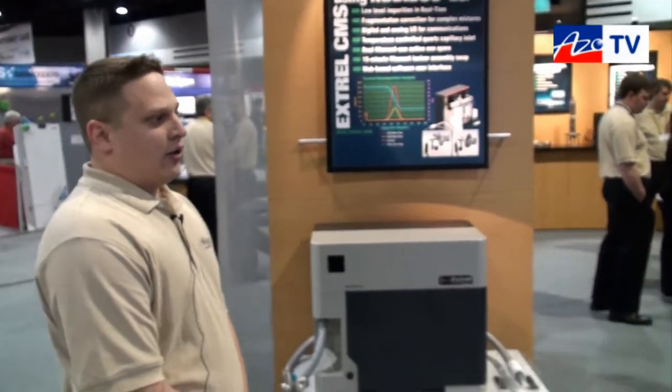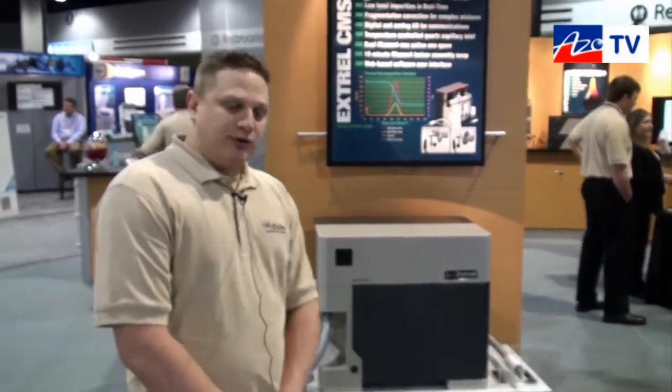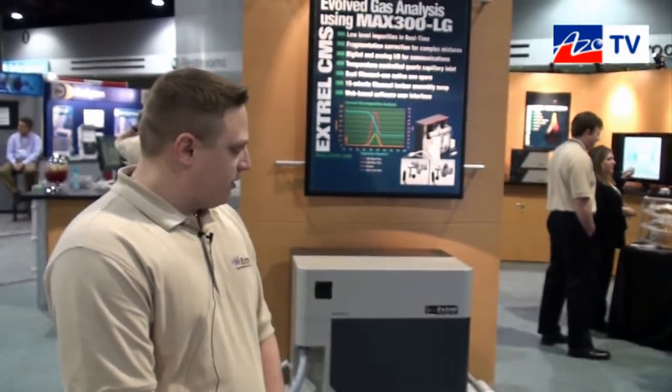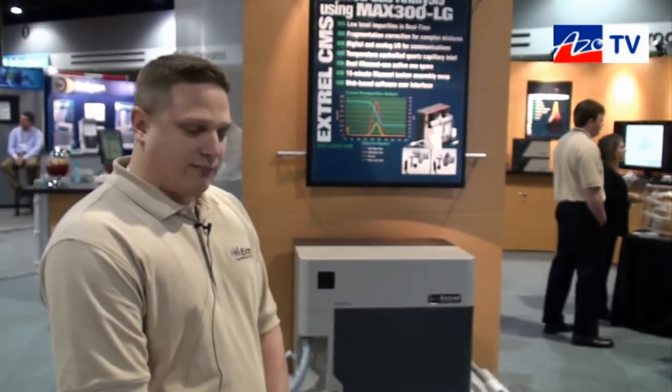In our 45 years of experience with mass spectrometers, we find that customers have many different requests and unique problems. One of the things we pride ourselves on is providing solutions for those problems using mass spectrometers any way we can.